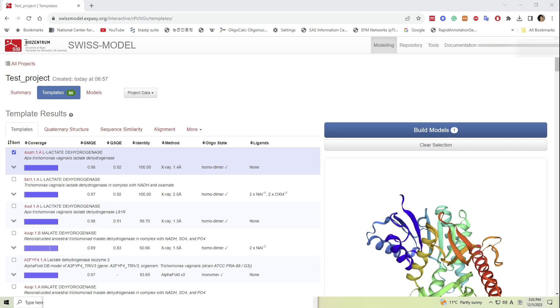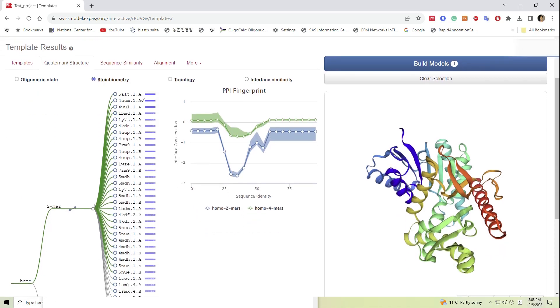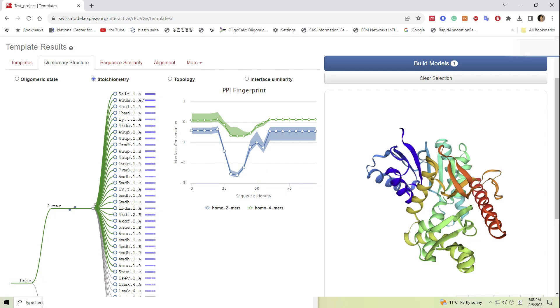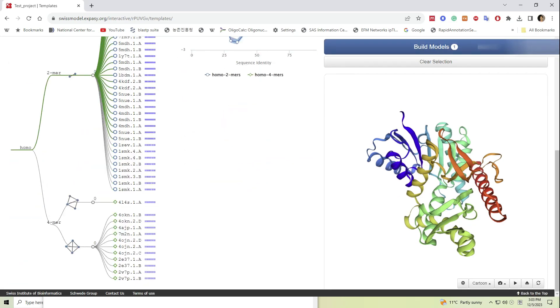An overview of proposed templates can be visualized by clicking on the quaternary structure, sequence similarity, and alignment tabs.